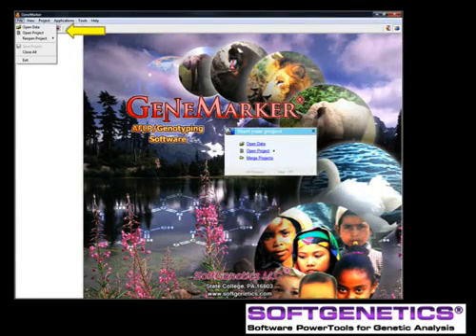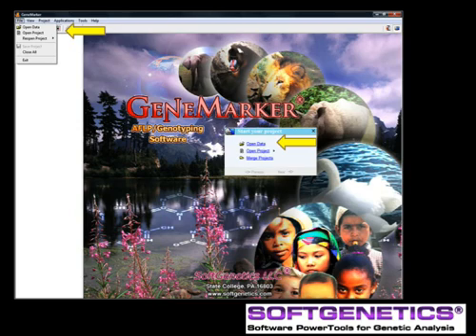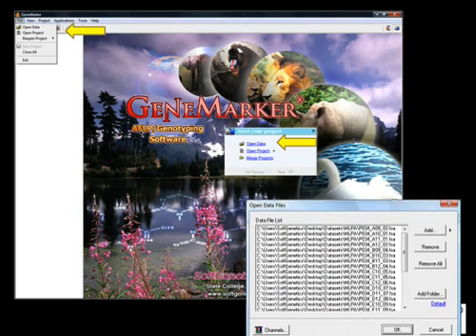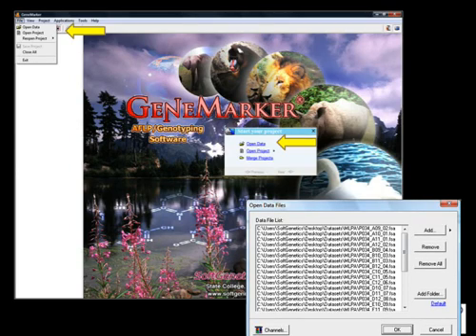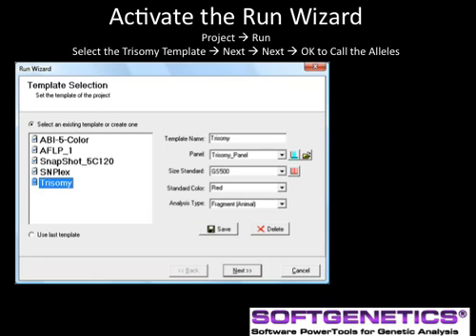We will start with a quick review of importing data. Data may be imported using the file drop-down menu or the Open Data link at the center of the screen. Default settings are for FSA files. Please refer to the introductory GeneMarker webinar for details on selecting dye channels for Beckman or Megabase files.